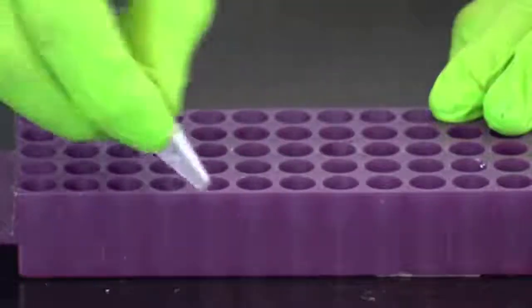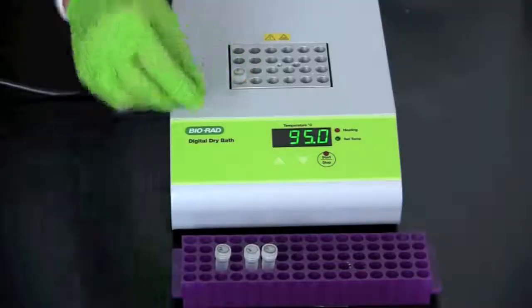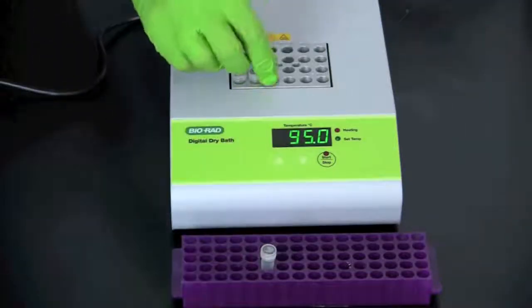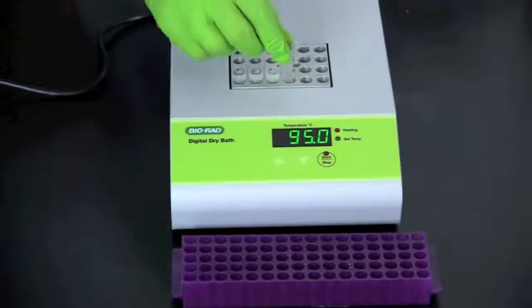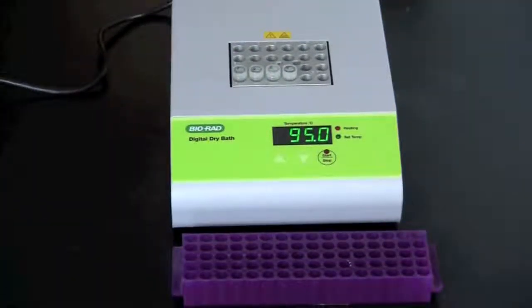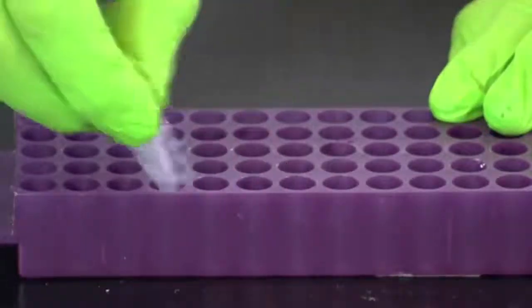Remove the tubes from the 56 degree incubation and vortex or shake them. Then incubate the tubes at 95 degrees Celsius for 5 minutes. After the incubation, vortex or shake the tubes.